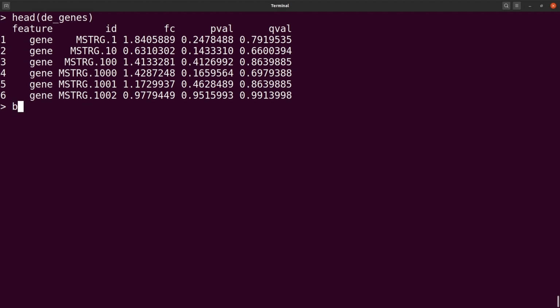So we are going to say bg first table, and then we say texpr, and then we say bg chrX first again. And then all. We want all the columns. So that's what we have here. Okay, so we have that table.